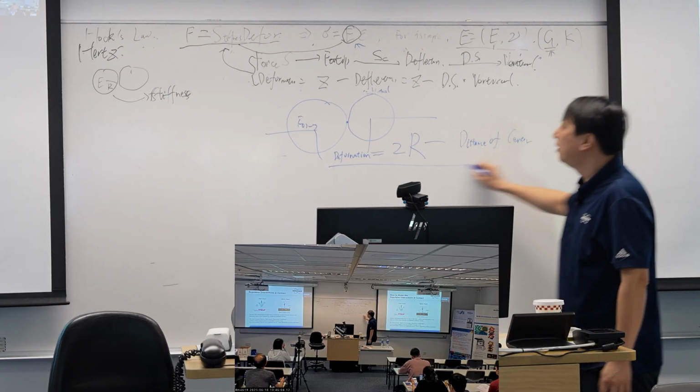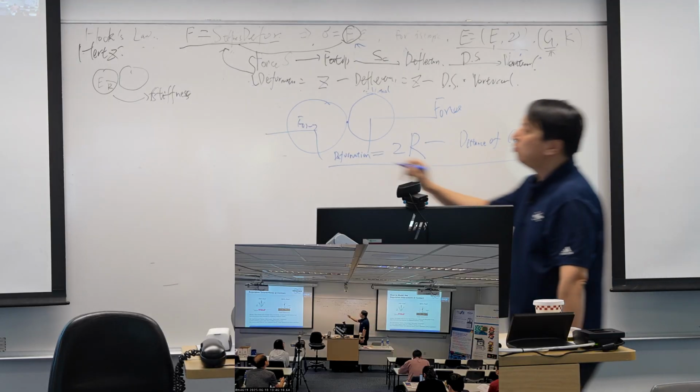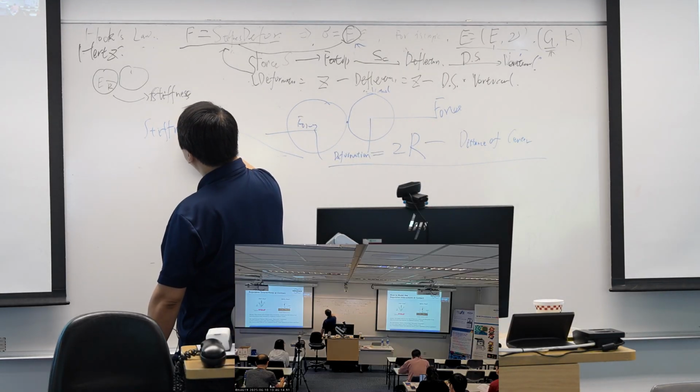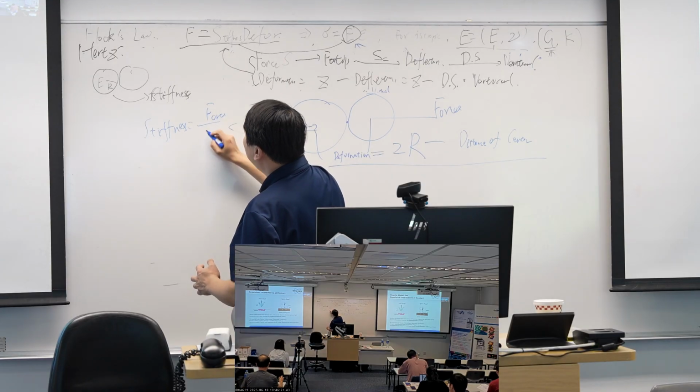That's how Hertz defined it. And then I can use a force to squeeze them. So Hertz would get the stiffness of these two spheres together equal to the force divided by the deformation.